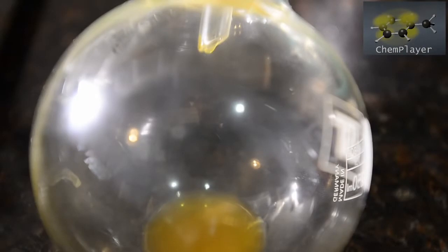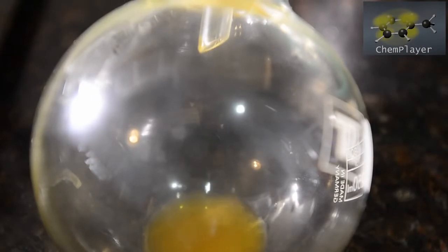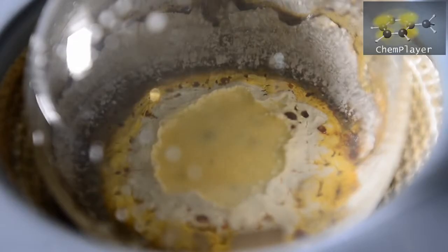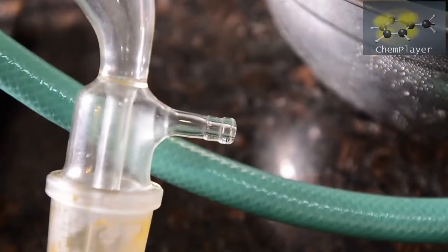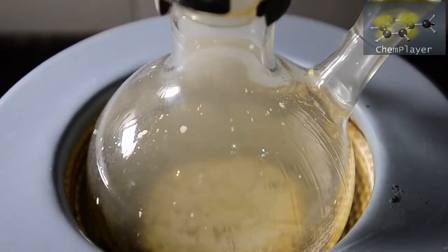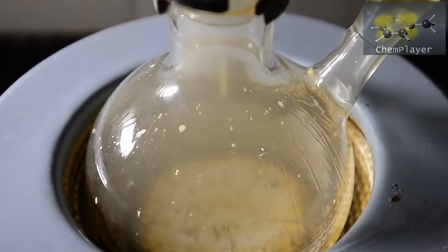We've now got a milky yellow liquid distilling off. The visible liquid in the boiling flask is now down to a small amount, and we've got some sulfur dioxide gas being produced and emitted from our apparatus. There's clearly something higher boiling left in the flask, so we keep going.